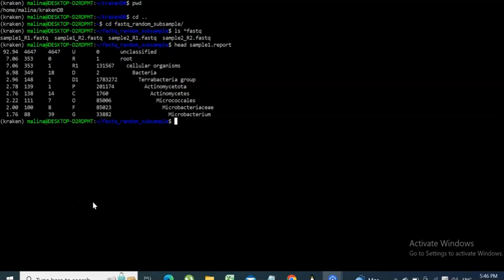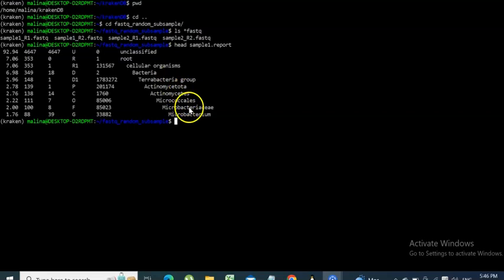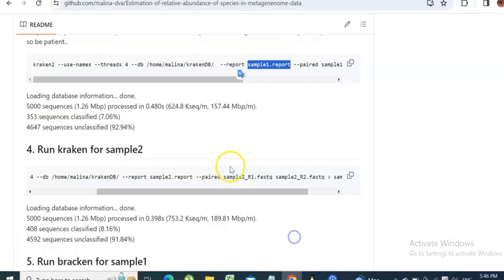In video one of this tutorial, we generated a Kraken report for sample one and had a quick look at what it contains. An important thing about the output is that most of the reads in our FASTQ files do not map to the database we use. The first and most probable reason is that most of the species in our sample are simply not present in the database.